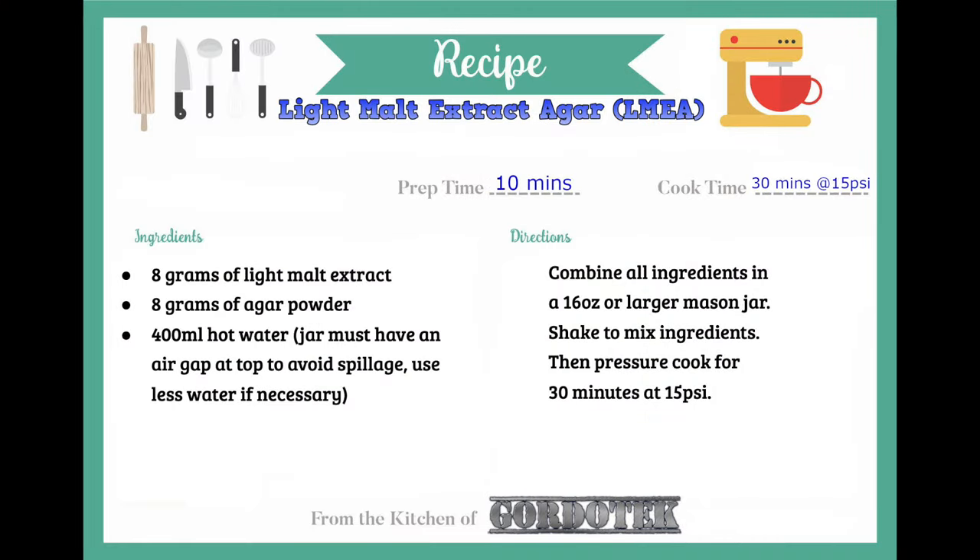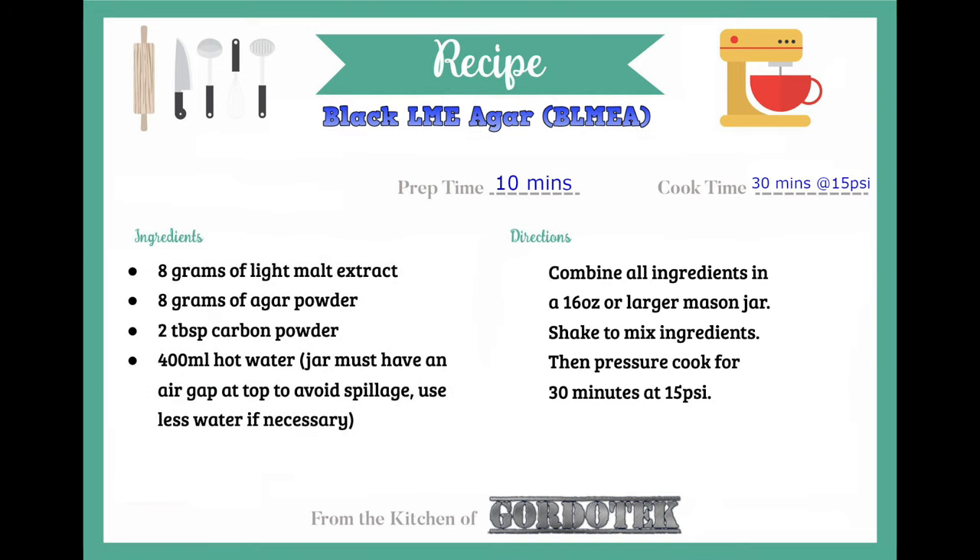Let's start by taking a quick look at the three recipes I will be making in this video. The most popular agar recipe is light malt extract agar, or LMEA, and this is the one I recommend. To make one 16-ounce jar of agar — which can be used to pour dozens of plates — you will need 8 grams of light malt extract, 8 grams of agar powder, and 400 milliliters of hot water. If you bought a pre-mixed malt extract agar powder, you would just combine that with hot water alone.